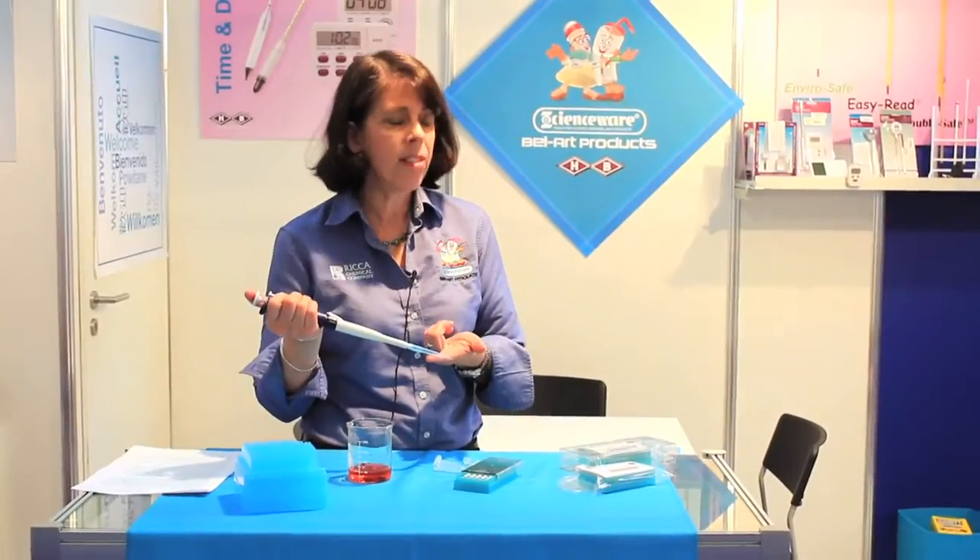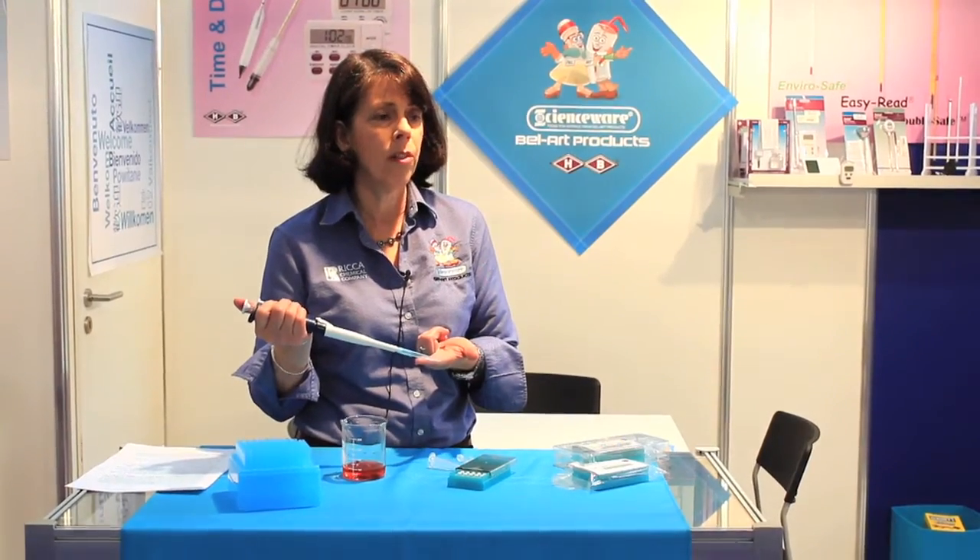The result is FlowMe, a 40 micron porosity filter that's designed to take the cellular debris out of your samples without retaining your sample and precious cells. FlowMe fits directly onto the end of a P1000 pipette tip, making it natural to your workflow.